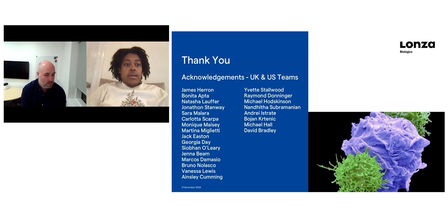Okay, next: in your ADC example, while you're testing a non-cytotoxic ADC, do you still assess and confirm DC viability? And how does in silico compare to MAPS data for ADC, native mAb versus thiomab? Yep, that's a great question. So yes, we do keep an eye on the viability. Obviously, if we see a reduction in the number of peptides with an ADC, is it because it has just killed all the dendritic cells? That's important to monitor. So we look at the viability of the cells and the activation state of the cells. There's also a step that ImmuneSpec carry out where they spot check some samples to check there's similar HLA across them, which they isolate and check by Western blot. So there are a number of stages where we check that there's nothing catastrophic happening with respect to an individual product.